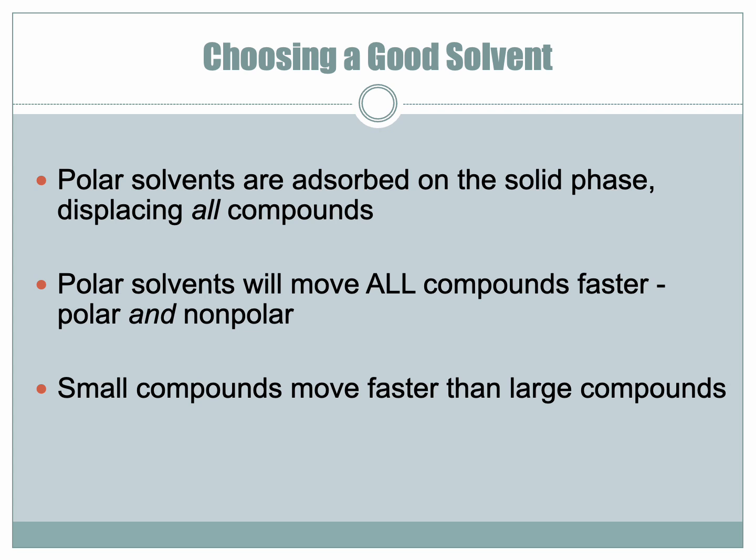separating. If both phases are very polar, then there is no separation that can occur because all of the compounds are going to have the same properties or the same behavior in the polar solid or on the polar liquid. They're both polar. They're both doing the same thing. And so we need to have our solvent be as non-polar as possible in order to get the best separation.